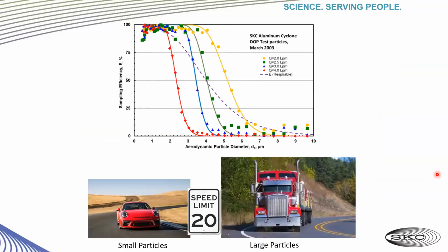A very simple analogy for this process would be to compare a small sports car to a large tractor trailer going down the highway at 20 miles per hour. At that speed, they can both obviously make most turns, just about any turn necessary.